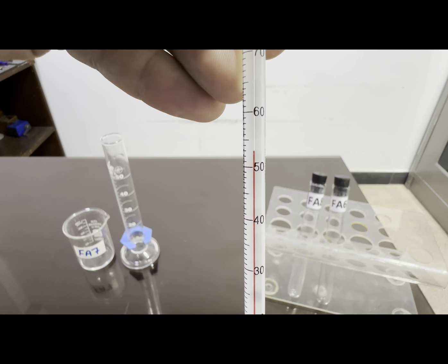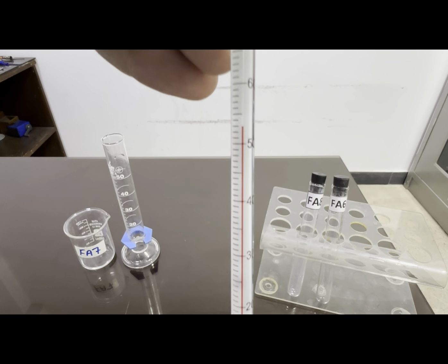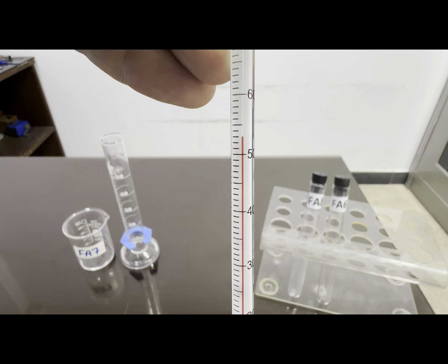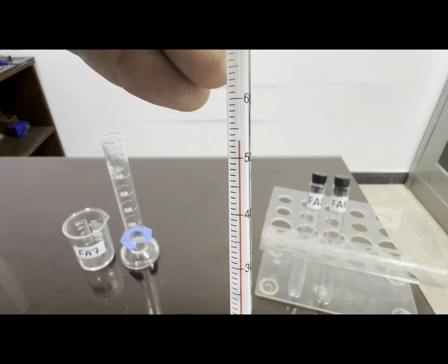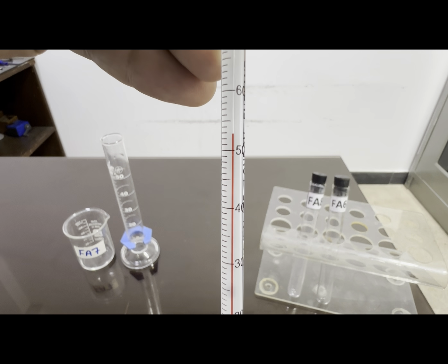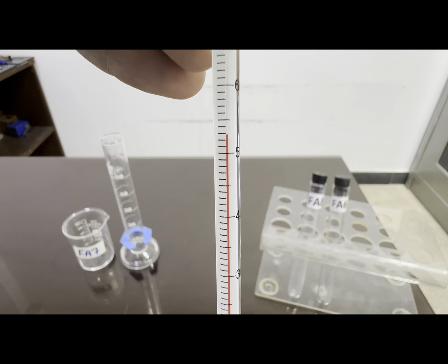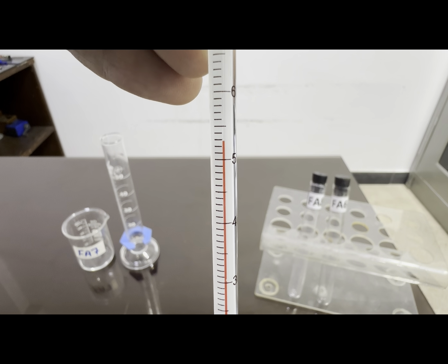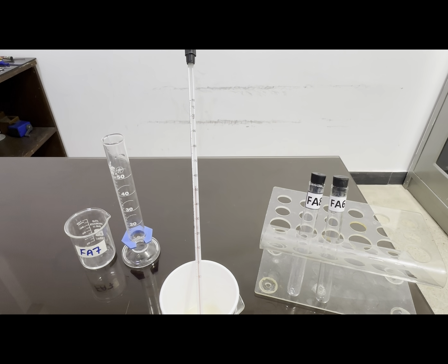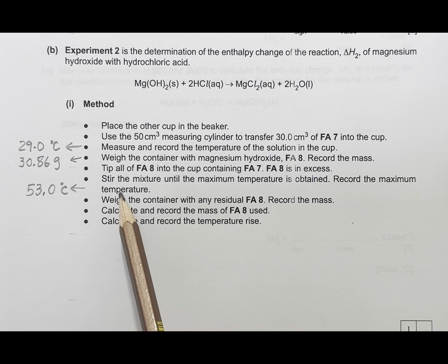It has reached up to 53.0 so far. It has reached a maximum of 53.0 degrees Celsius. Not increasing anymore, rather it starts decreasing now. So the maximum recorded temperature is 53.0 degrees Celsius.